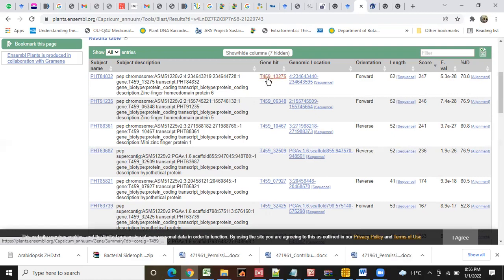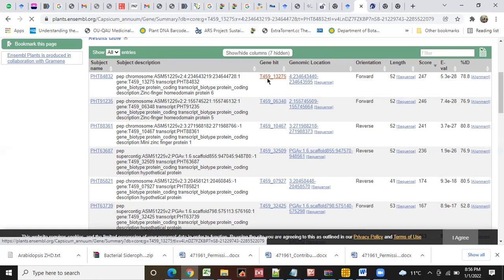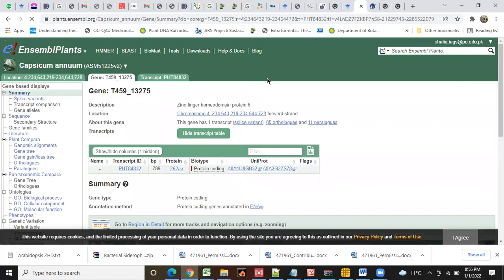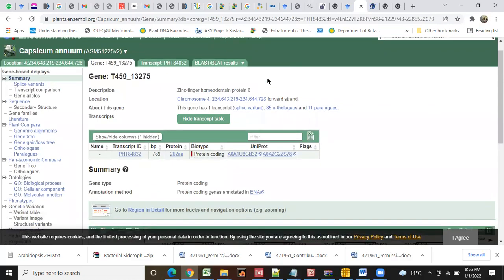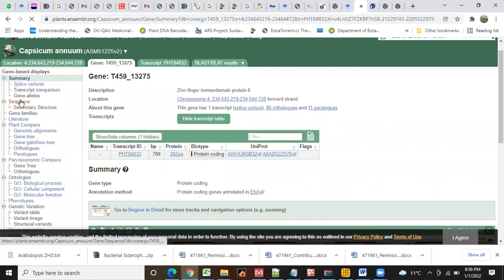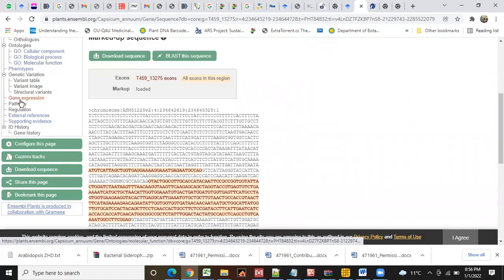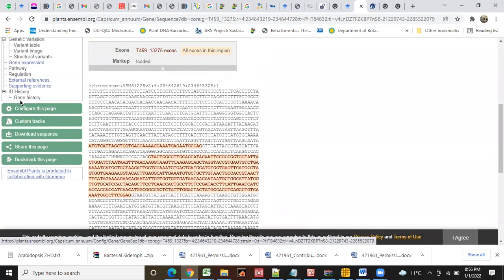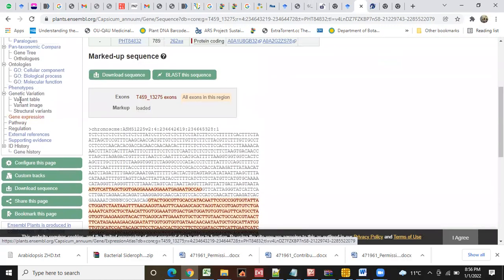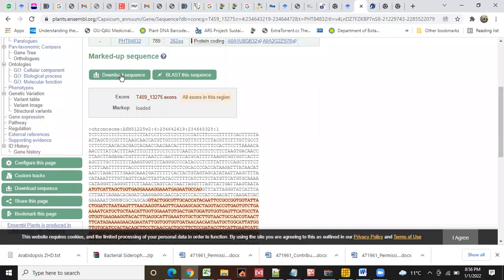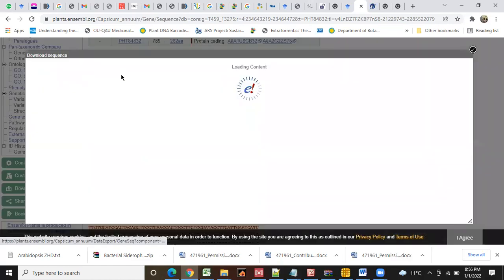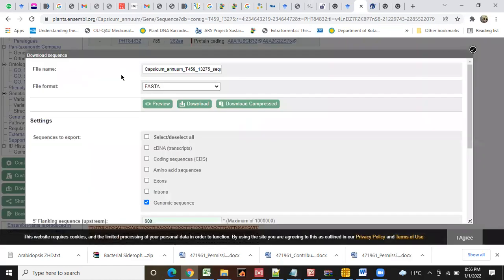First of all, we will click here on gene hit. You have to click each and every sequence. Then you will go to the sequence here. Then you will go towards download a sequence. From here, you will select genomic sequence.